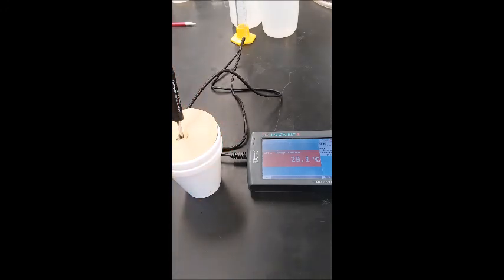Notice that the temperature is increasing as the neutralization reaction occurs. We find that the final temperature of our neutralized mixture is 29.8 degrees Celsius.